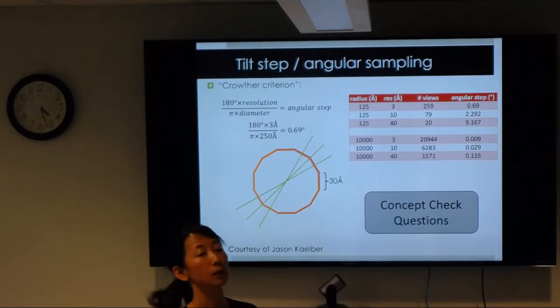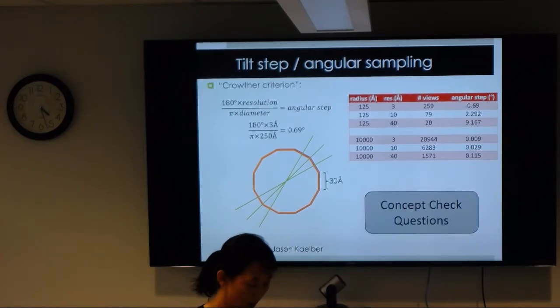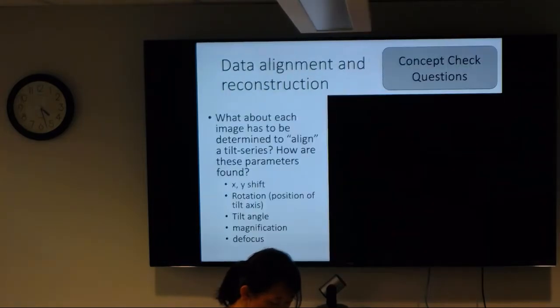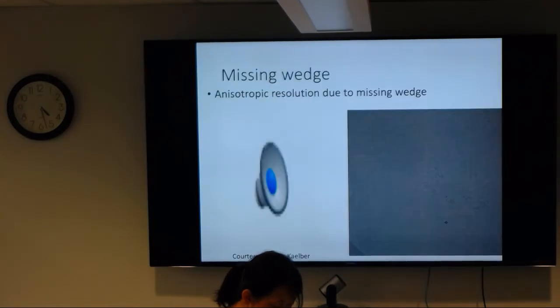Do they still do any more of the 90-degree rotation to help fill the missing wedge? I don't hear much about it. Yeah, they do. I have a slide to show. Can I get out of PowerPoint? Okay, you brought it up, we should just go over it.